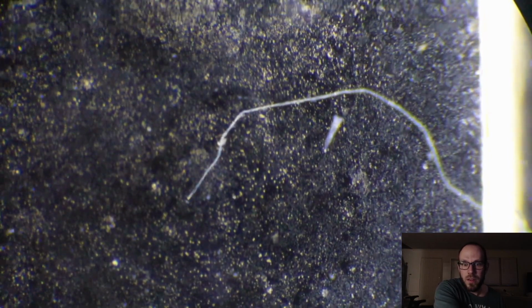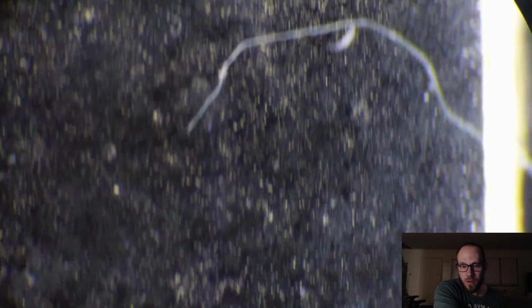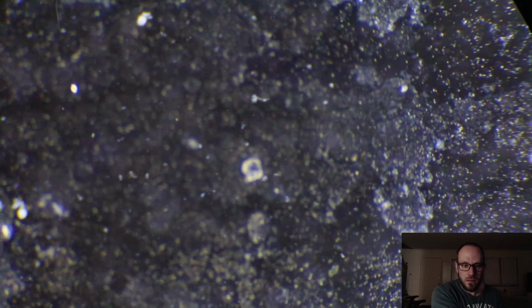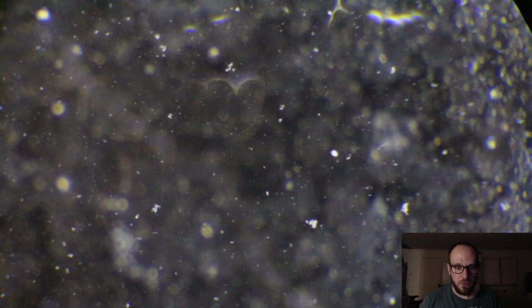Yeah, this stuff is so weird. I'm pretty sure it's some kind of fungus, but the rotifers are still hanging out in it. They love it. So, whoa! It's so weird because some of them inchworm and others just swim along. Wondering if I got several species of them in here. But yeah, this is my favorite slide. It's just rife with rotifers everywhere, all the time. Rotifer, rotifer, rotifer. And it's just cool that I've been able to keep it alive for so long.